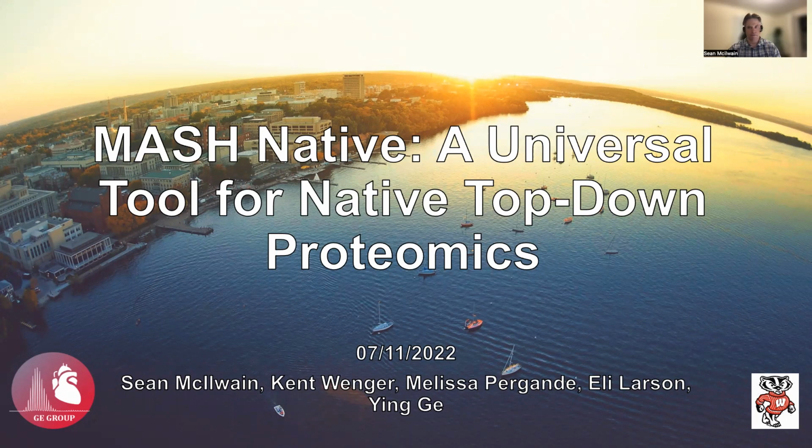My talk is entitled MASH Native, a Universal Tool for Native Mass Spectrometry and Top-Down Proteomics. Top-down mass spectrometry is a powerful method for comprehensively characterizing proteoforms, which arise from genetic variations and post-translational modification.